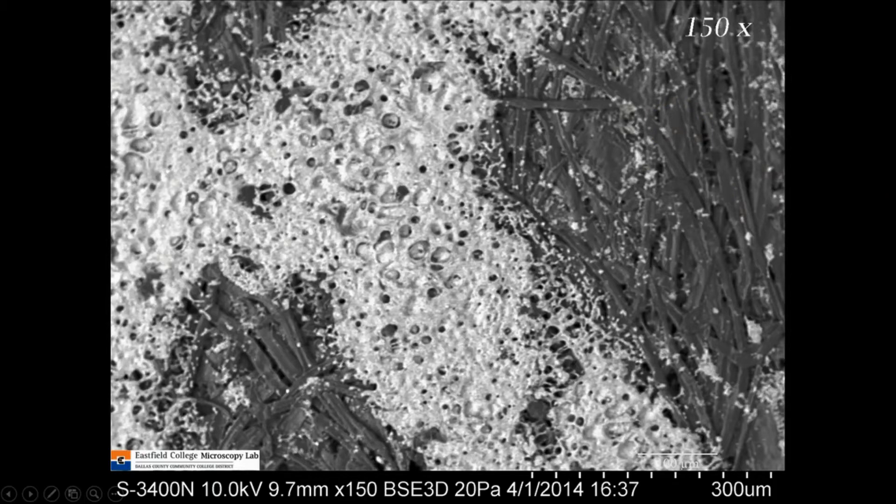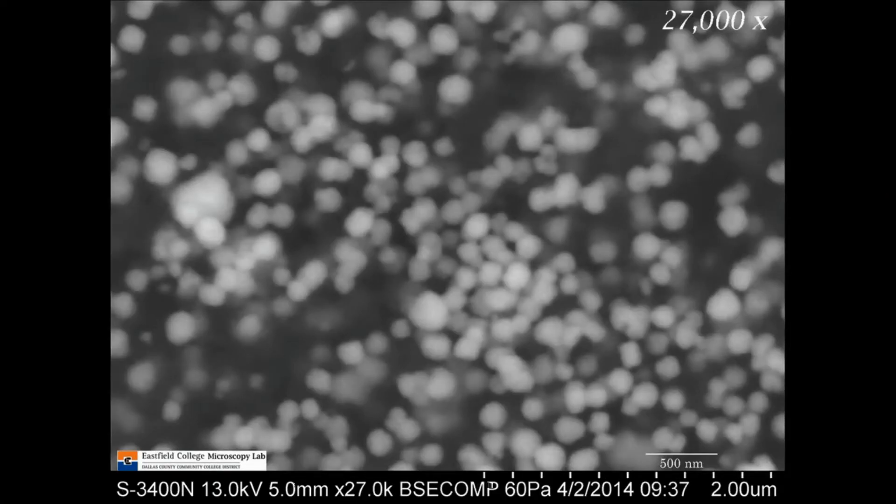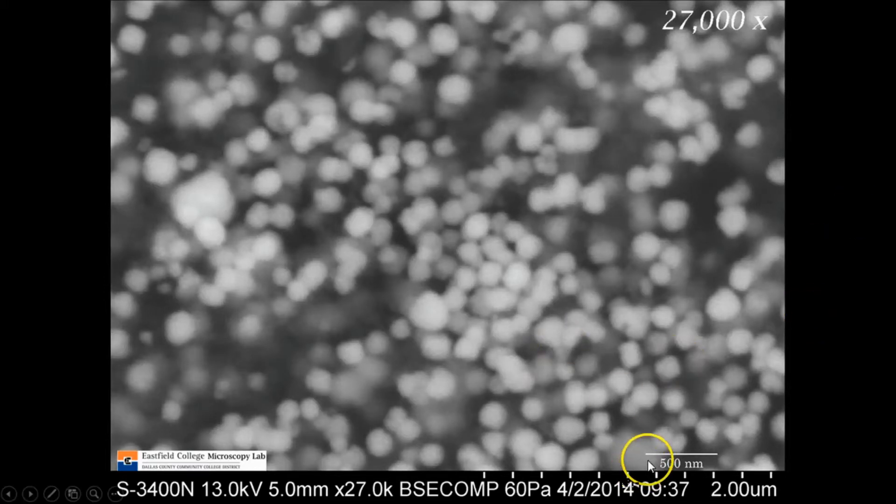Let's really put the electron microscope to use now. This is an image taken at 27,000 times magnification, and now you can really get a look at those little ink particles. They're pretty uniform in size — there are some big blobs, but in general they're pretty uniform. I want to point out a scale bar down here. The distance between the ends of this scale bar is 500 nanometers — a unit that most people don't deal with on a daily basis. We'll explain that in just a second, but just keep this image in mind.